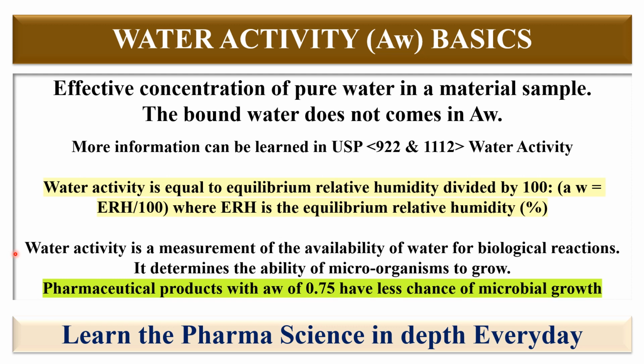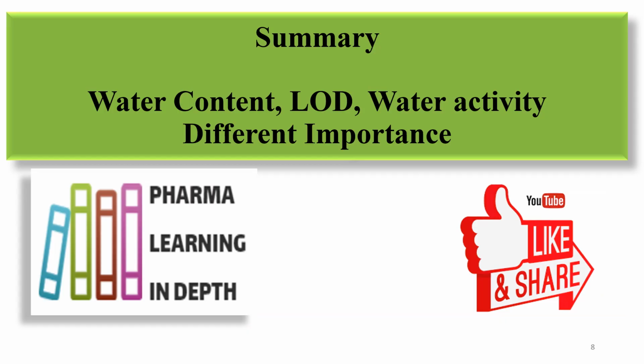So these are the main differences between LOD, water activity, and the water content. Every test has a different meaning, different testing, and different importance.